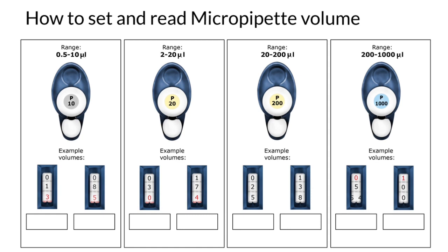P200, you can work with up to 200 microliters with this micropipette and the range is between 20 and 200. And P1000, you use if you want to work with volume between 200 and 1000 microliters.